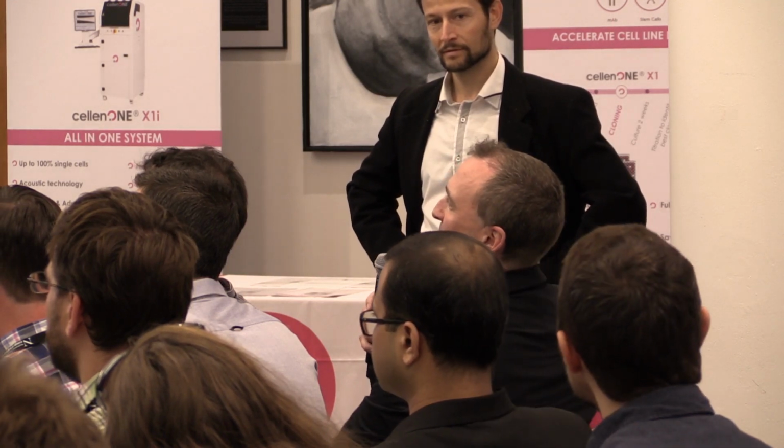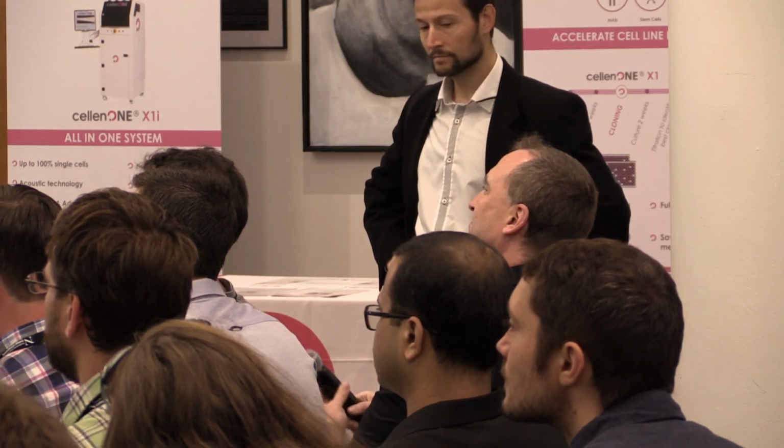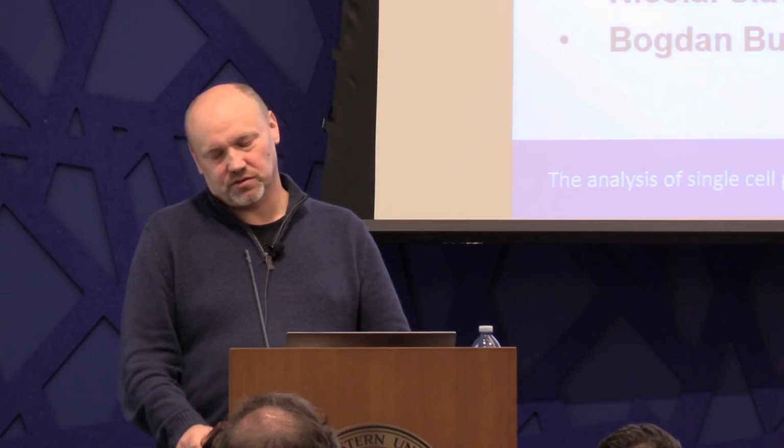I'm sure the south of Munich is much lovelier than the north, but aren't you concerned that the learner algorithm is just rediscovering the biases of MaxQuant, as opposed to the approach using synthetic peptides where you don't have a cutoff for matches? And can you extend it beyond MaxQuant? Well, not necessarily MaxQuant, but the peptides that we identify, basically, right? So, yeah, sure.